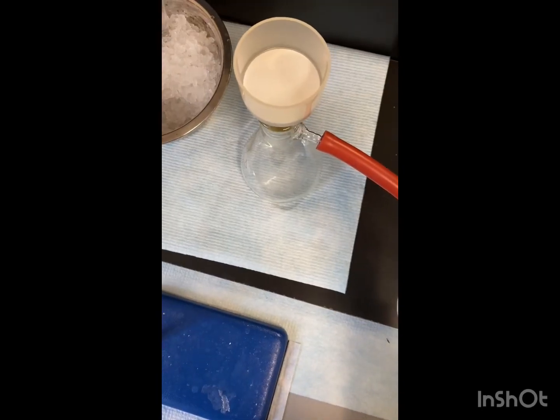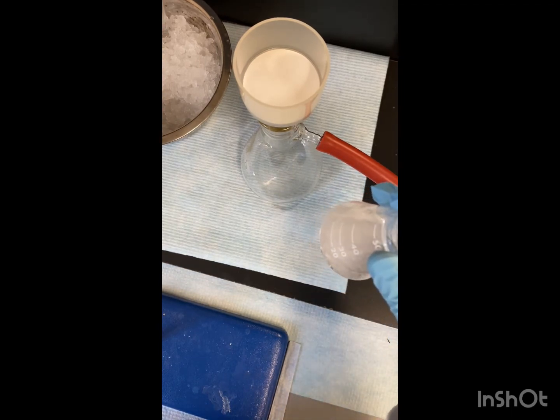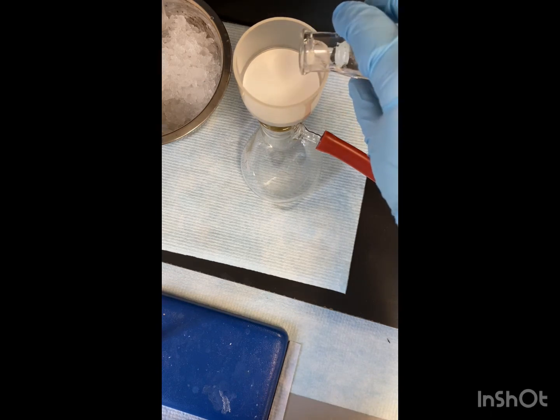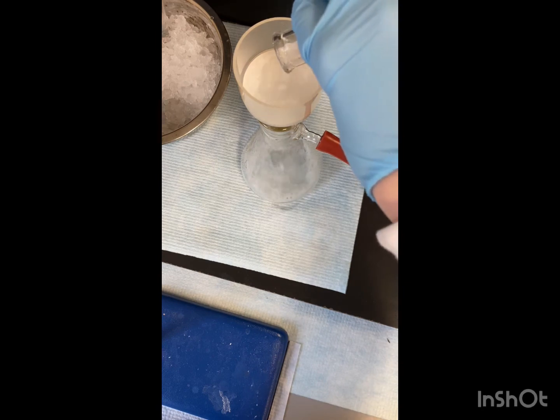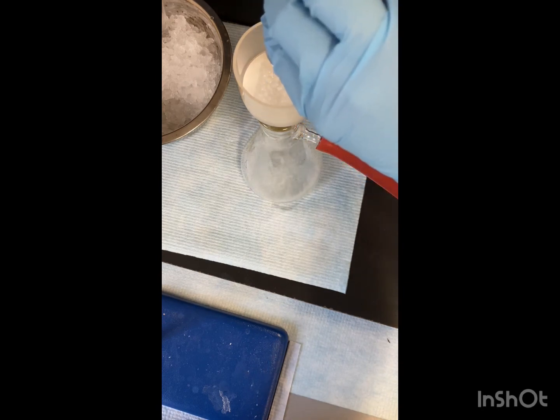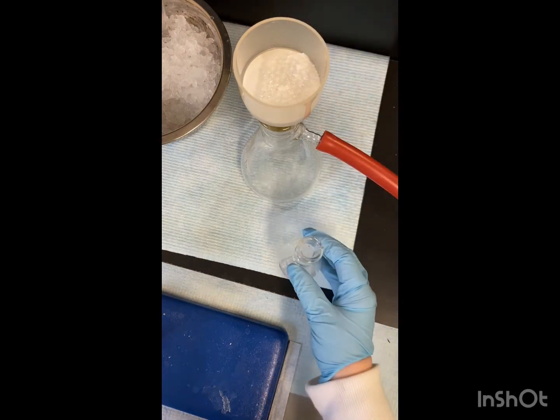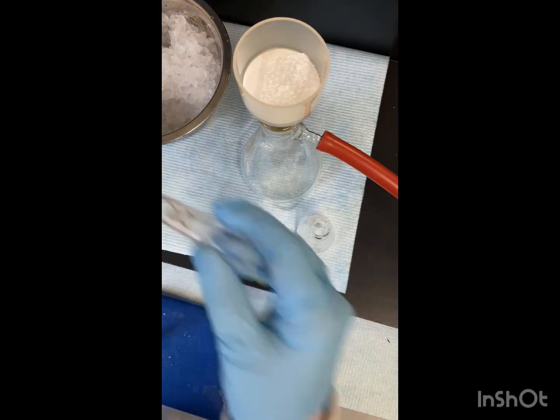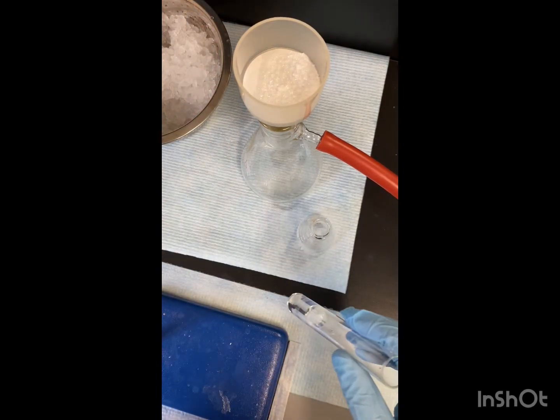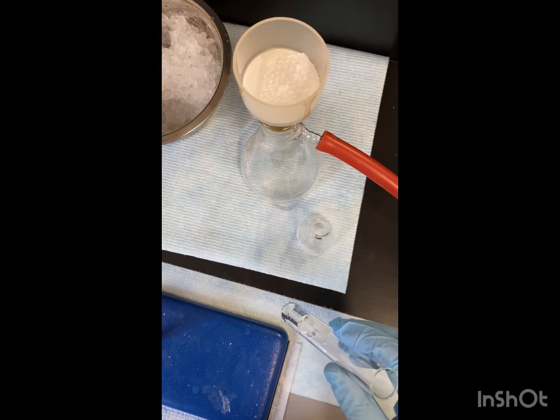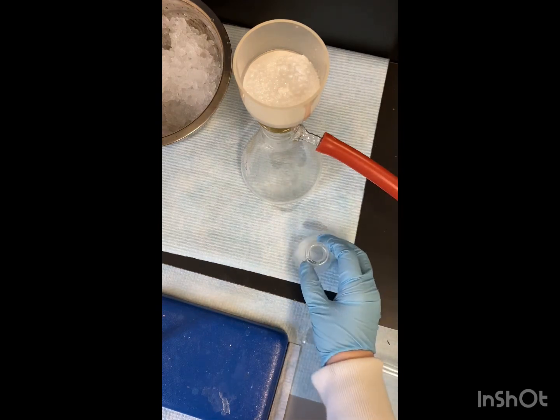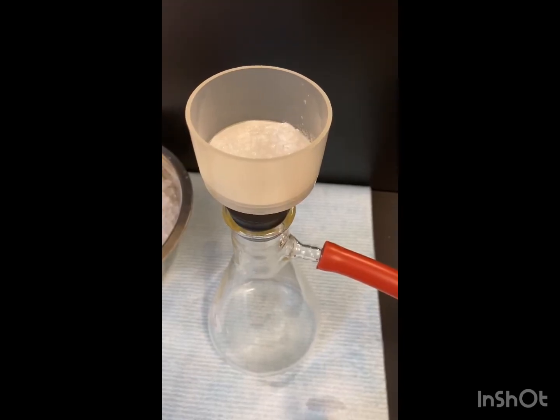Turn on the vacuum. I have our solution in our flask, and we're just going to put it into our vacuum filtration. We're going to take our cooled off crystal water here and just help transfer some more crystals over. We're going to let this dry.